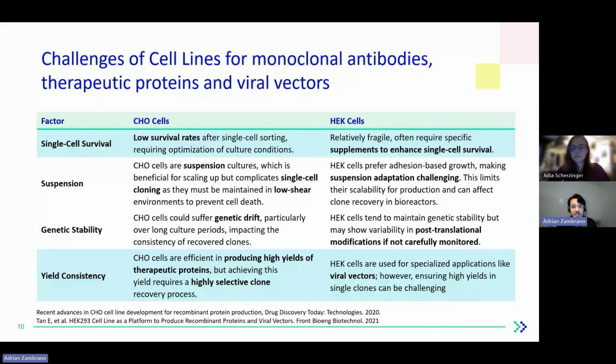Having said that, I would like to highlight the relevance also of what I just said about clonality, and that's because clonality can also affect directly and indirectly some of the optimization steps, and this is why there are such requirements, right? Clonality supports product quality, safety, drug efficacy, in addition to being a part of the regulatory requirement. Finally, also extremely important, all of these impact the cost effectiveness of the whole process, especially when not done correctly. This can really minimize or increase costs. For take-home message, scientists are seeking reliable processes and technologies.